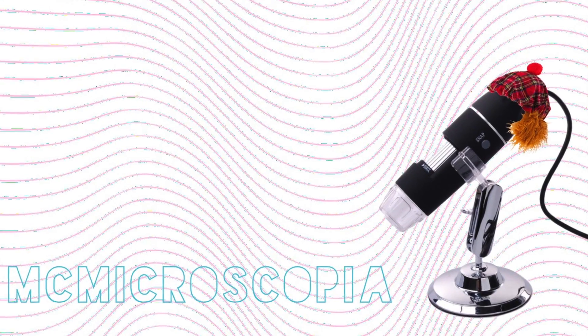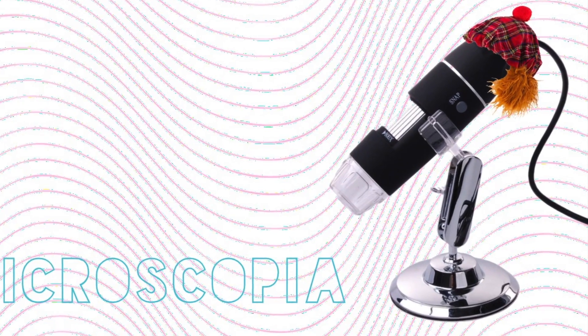If you eat it, a sore belly will come. It's time for more Mcmicroscopia and today, it's a bit of a gross one actually.